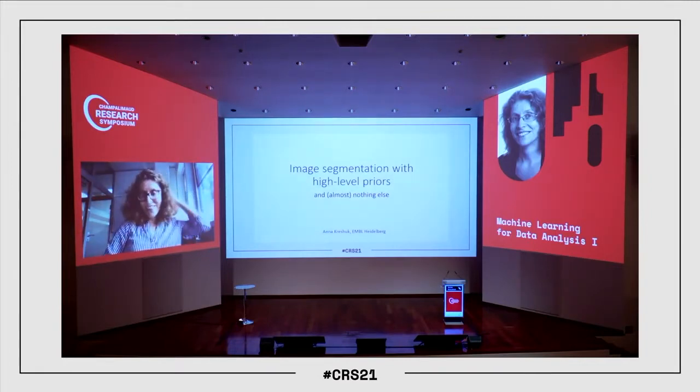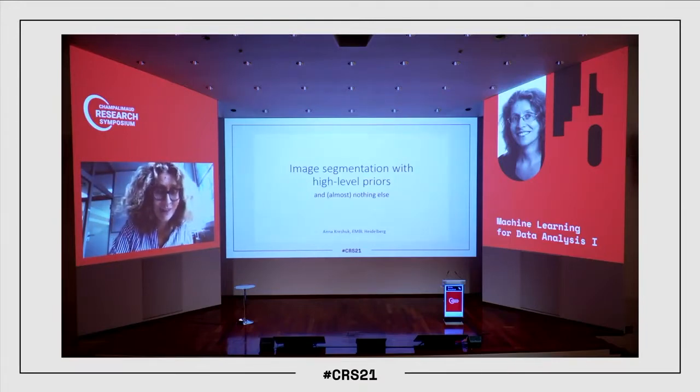All right. So, yeah, thank you very much for inviting me and for getting over there to watch my talk. Today I want to tell you about the work that my group is doing at EMBL for image segmentation of microscopy data and how we are trying to incorporate the human knowledge about the expectation of the things that we will find in microscopy images into the segmentation procedures.